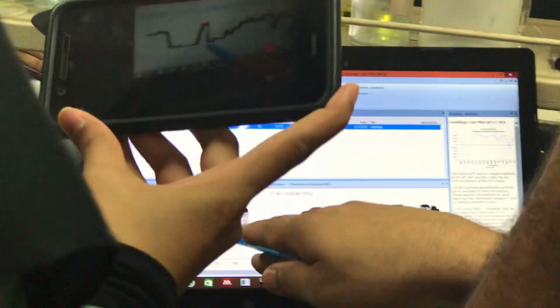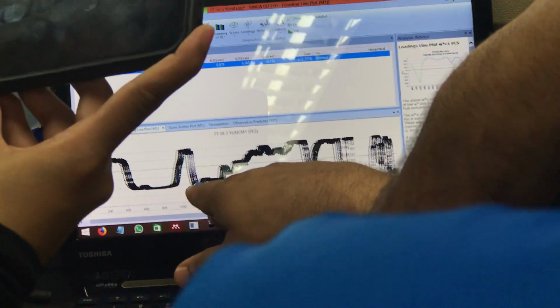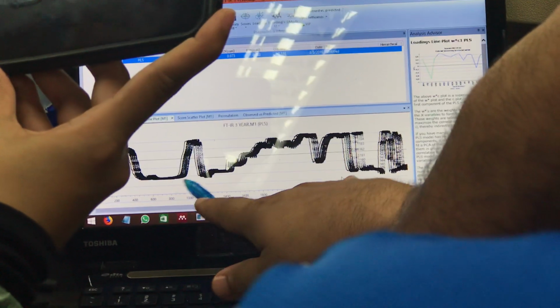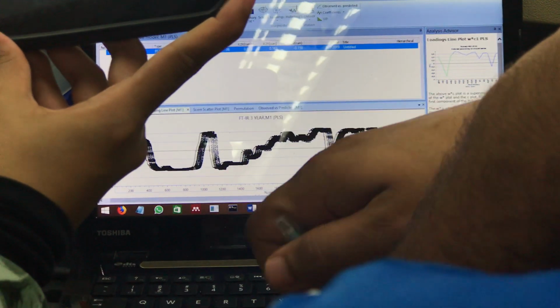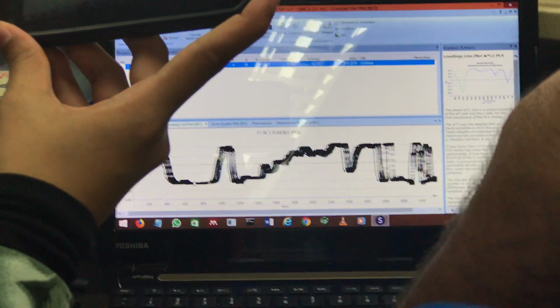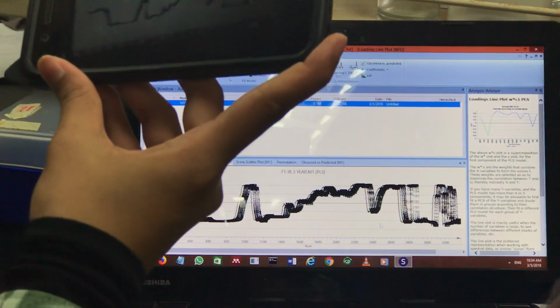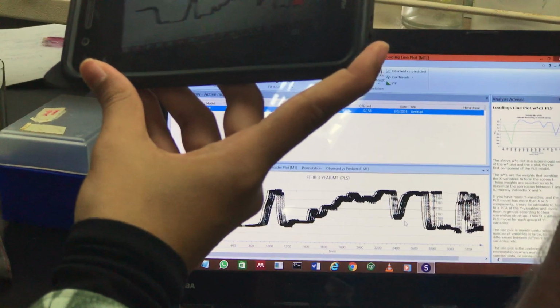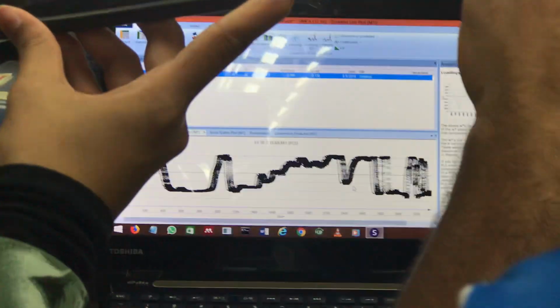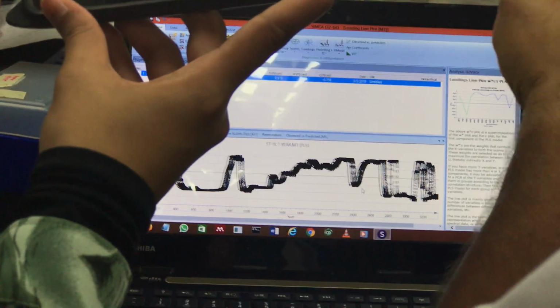This is all the spectra. You can see all the spectrum. Yeah, it's all the 36 spectrum. So they produce the same pattern. You can see all these 36. No, then it's not a component. Components only they will predict. They will tell the difference.